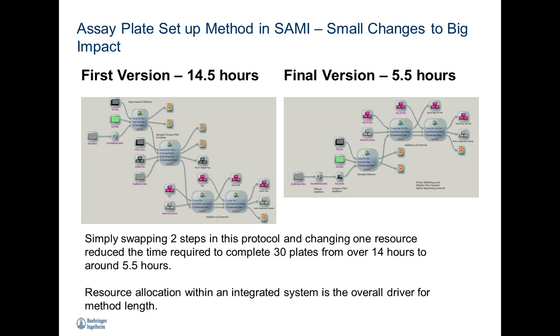And a lot of that is around resource allocation within an integrated system. If you have your liquid handler being used too much to move components around your system, that resource is not available to do any liquid handling. So that is going to greatly stretch out the overall time that it's going to take for something like this.